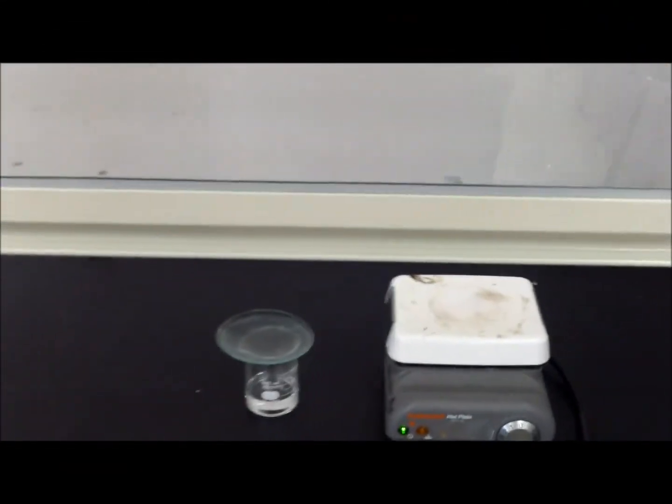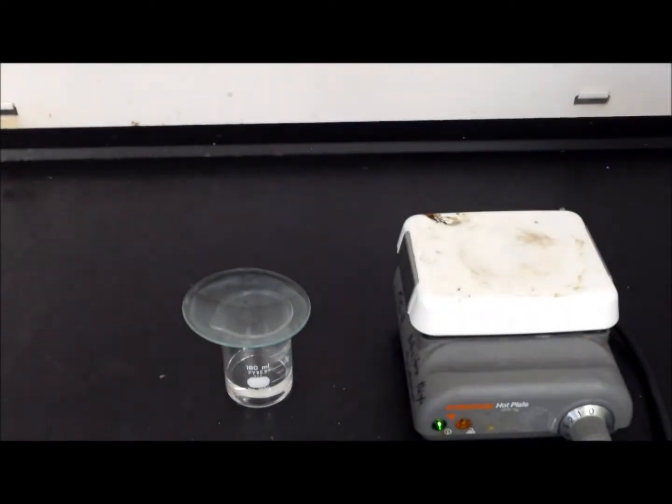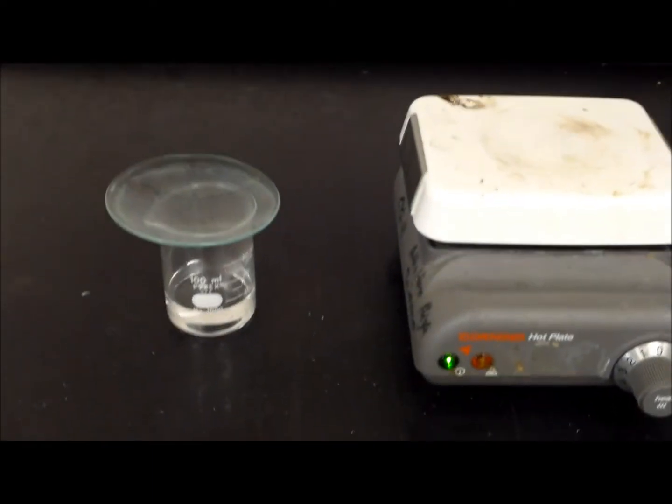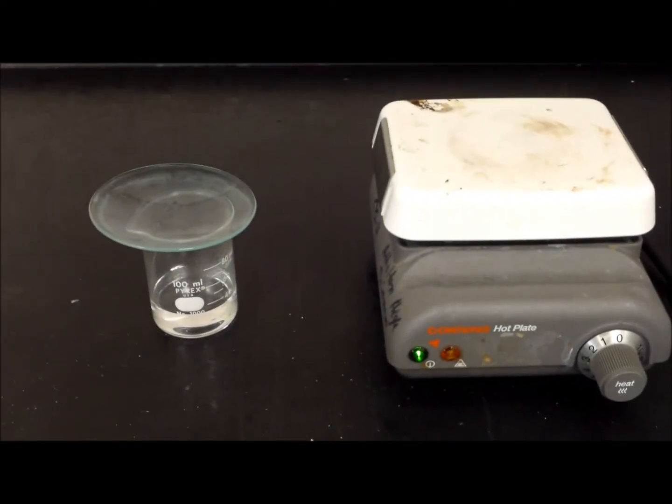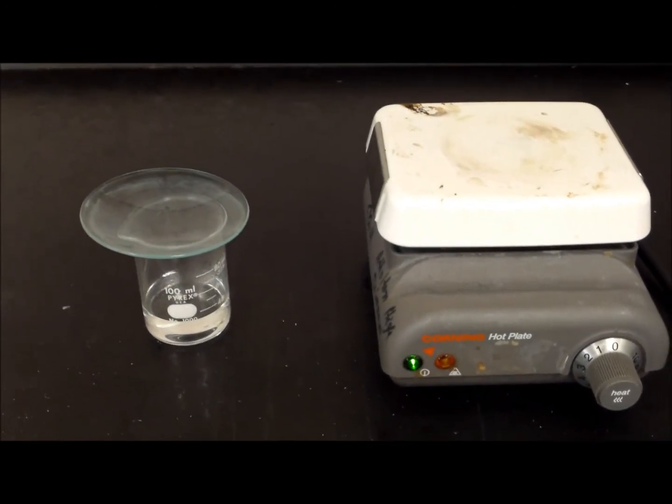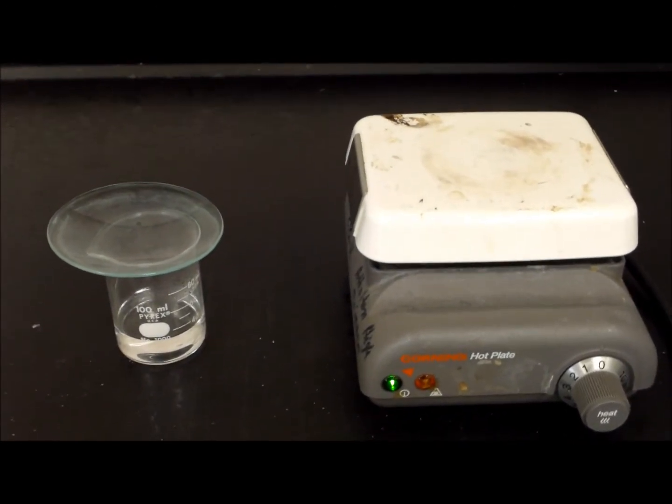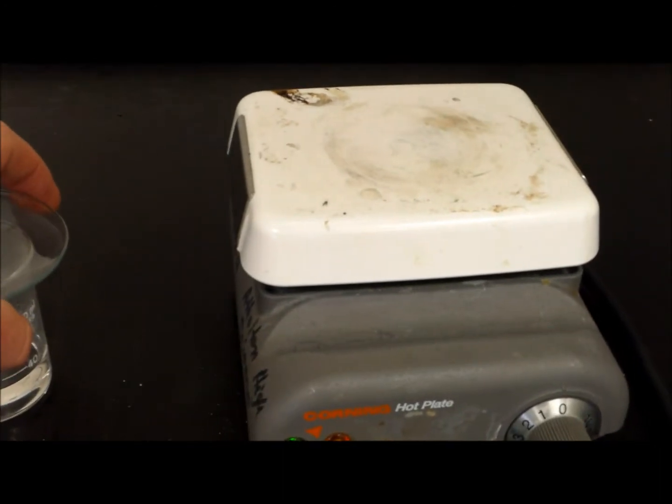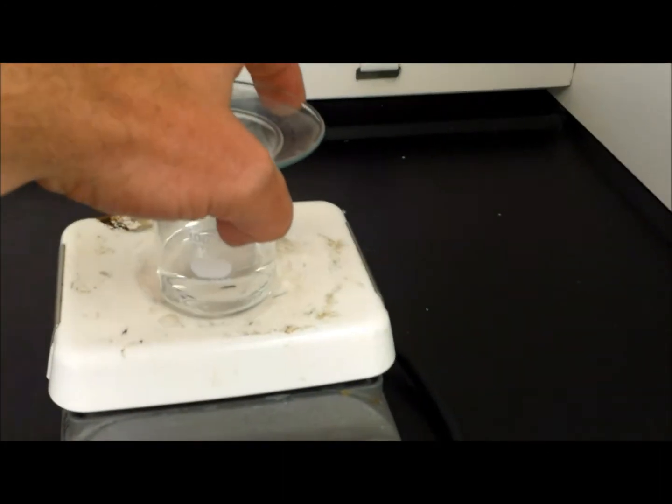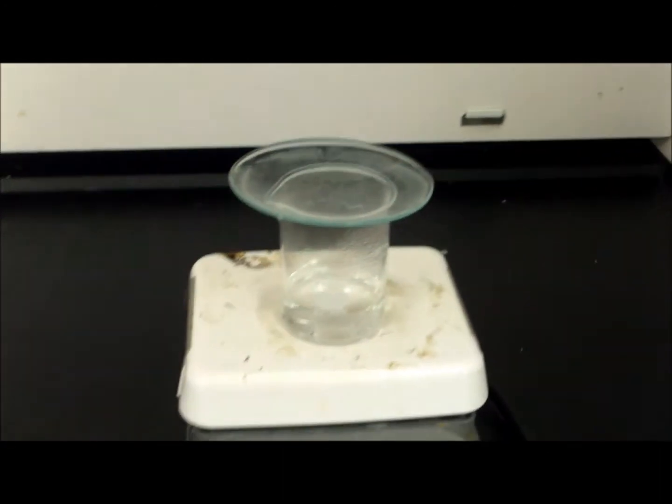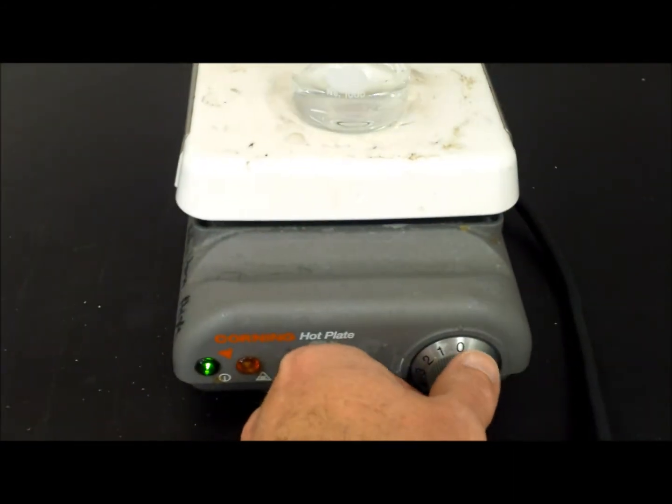There's a possibility that there is some unreacted hydrochloric acid still in the beaker. So when we heat this, if there's unreacted hydrochloric acid, that could go into the air and that's not something that we'd want to breathe in. So I'm going to go ahead and place this beaker with a watch glass on top just to control any spattering, and I'm going to go ahead and start heating this.